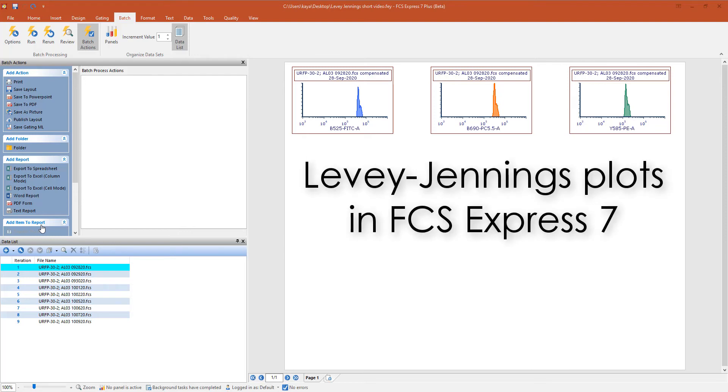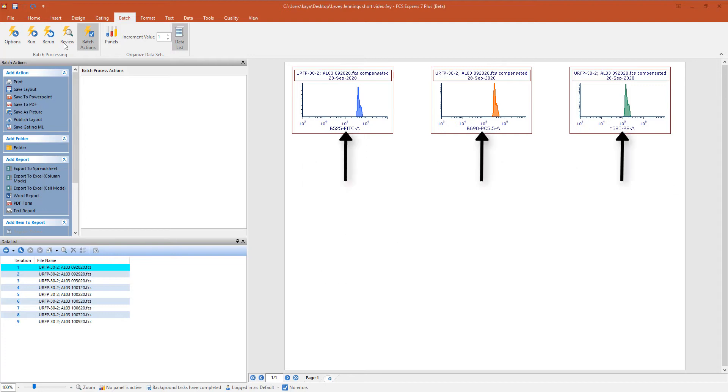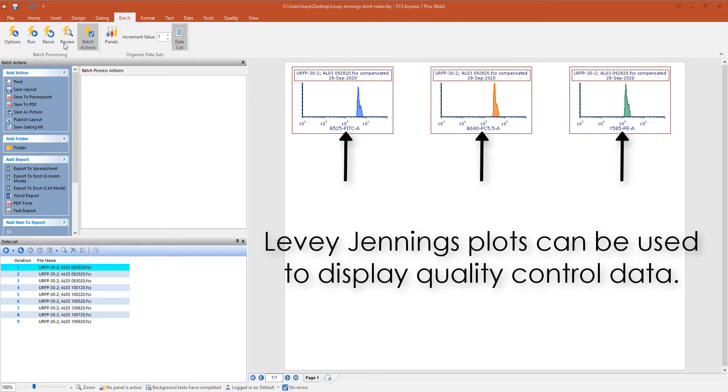Levey-Jennings Plots in FCS Express 7. We will create Levey-Jennings Plots for the three parameters shown.